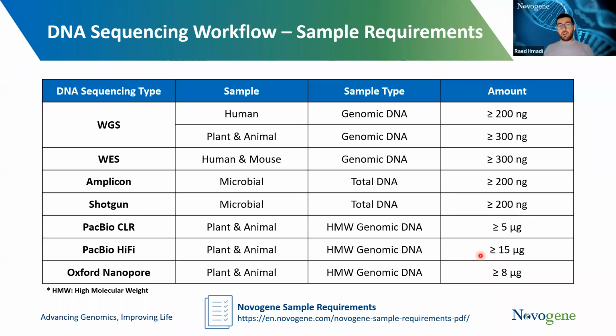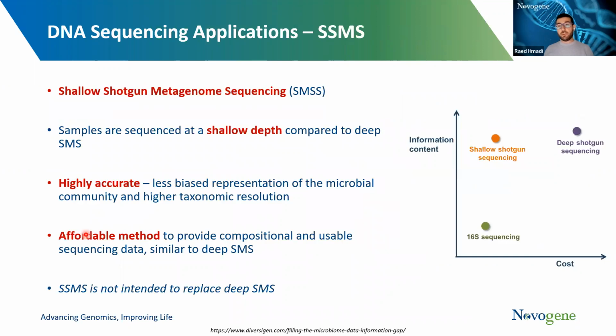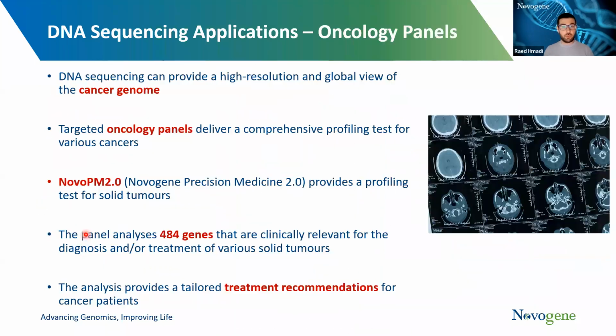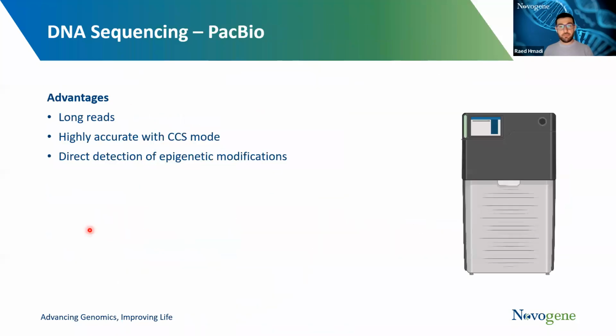Yeah, so with PacBio, since we are sequencing the DNA directly, omitting any PCR amplification steps, any epigenetic modification, such as DNA methylation, that happens on the DNA itself will be preserved. And with this, the instrument is actually able to determine that a nucleotide is methylated. I will go to one of the previous slides to explain it better.